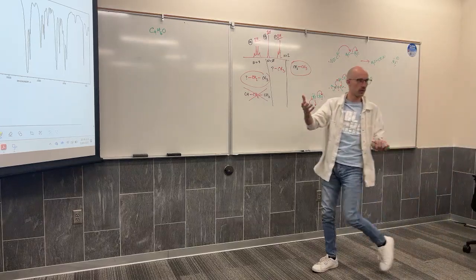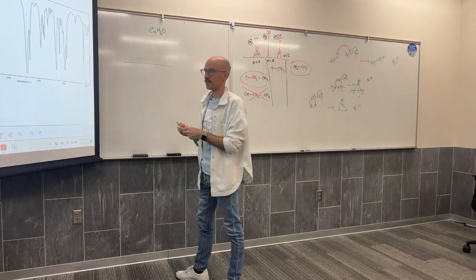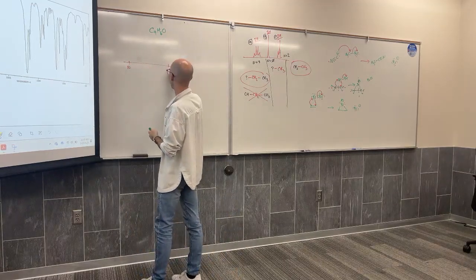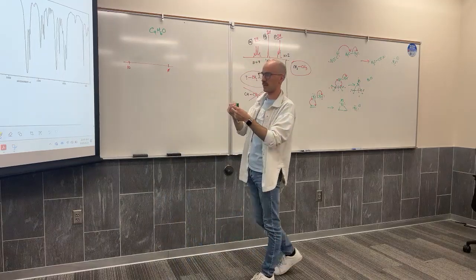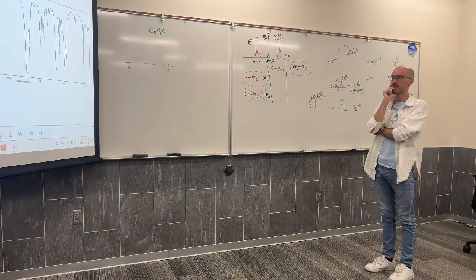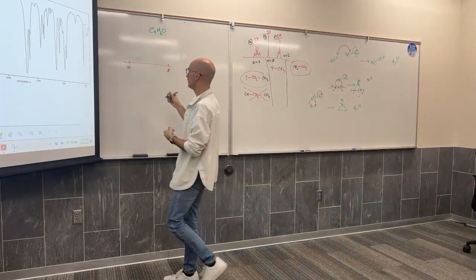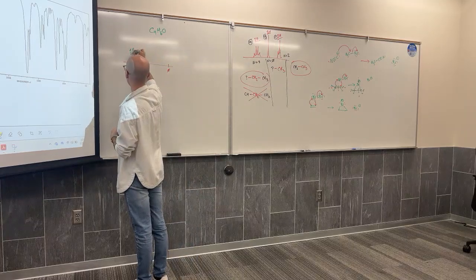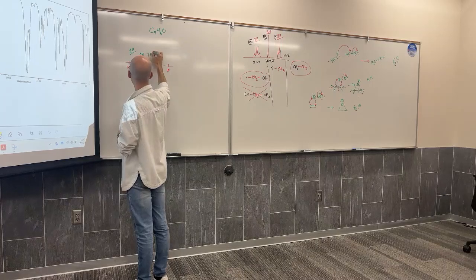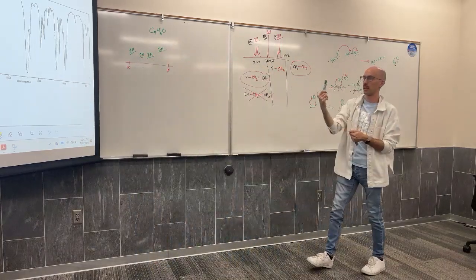By the way, I'm going to give you integration values without really trying to redraw those signals. So we've got integration of 1H, 1H, 1H, and 3H as you move from left to right.